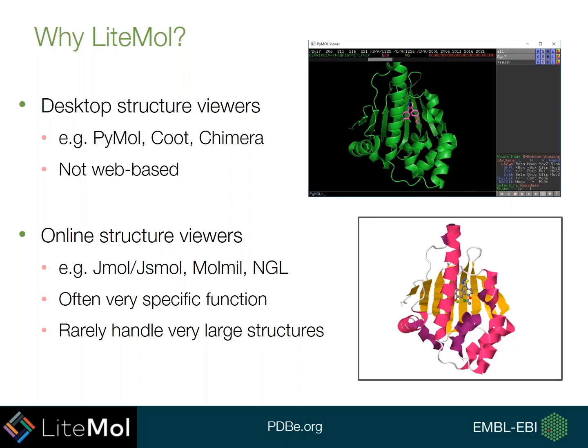There are, however, a lot of online structure viewers. You have things like JSmol, Molmil, and NGL. Often these have a very specific function. They do a particular job well. Usually they rarely handle very large structures. So what LiteMol aims to do is fill in this gap to enable you to do a range of different things with your structure viewing and handle very large structures in an online viewer.